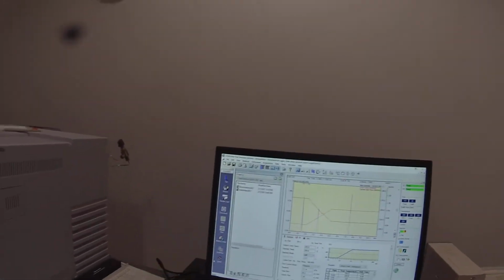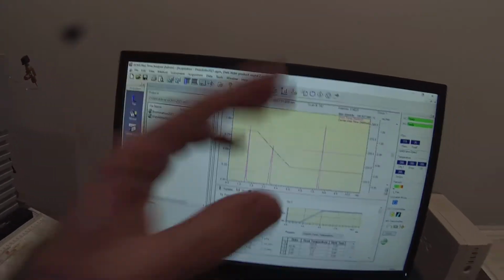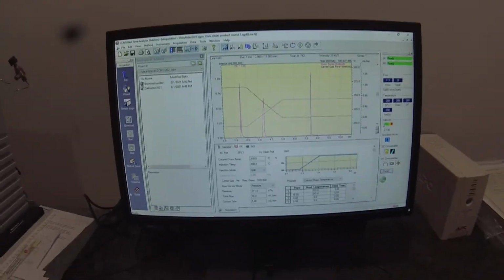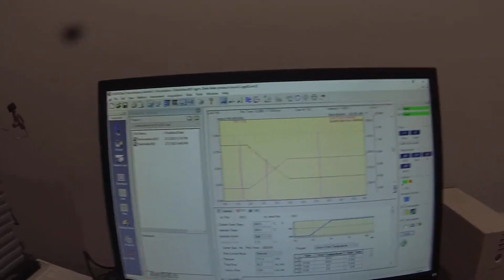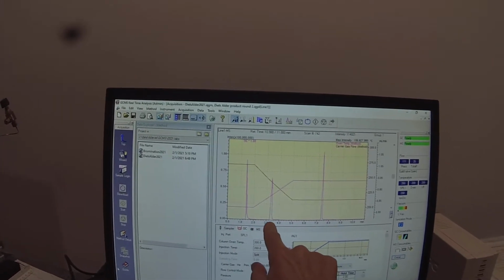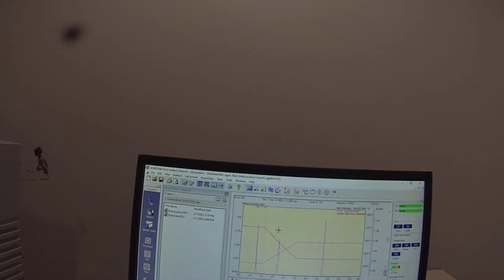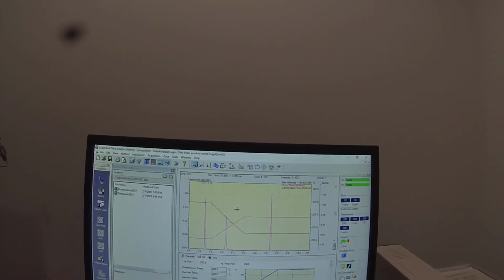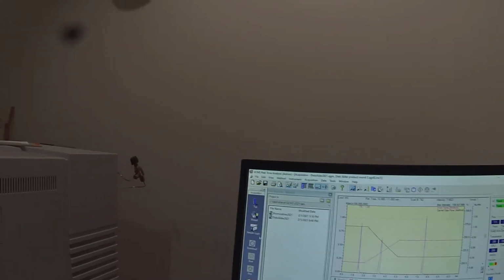While we were running the IR spectrum on our Diels Alder product, the GCMS finished its work, and you can see that there are 3 peaks. I'll angle the camera again. I think you can see that there are 3 peaks, one coming off very rapidly, then one between 3 and 4, and then another peak between 7 and 8. That's rather an interesting result, given that we thought the solid that we isolated was pure.